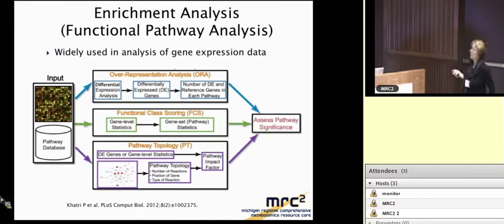But in a nutshell, you have to have your reference database. It can be a database that maps your genes or metabolites or whatever you're trying to analyze to metabolic pathways or to biological pathways. These can be GO terms or any other predefined biological categories, as long as they're meaningful to researchers. Okay, and you have your input data.